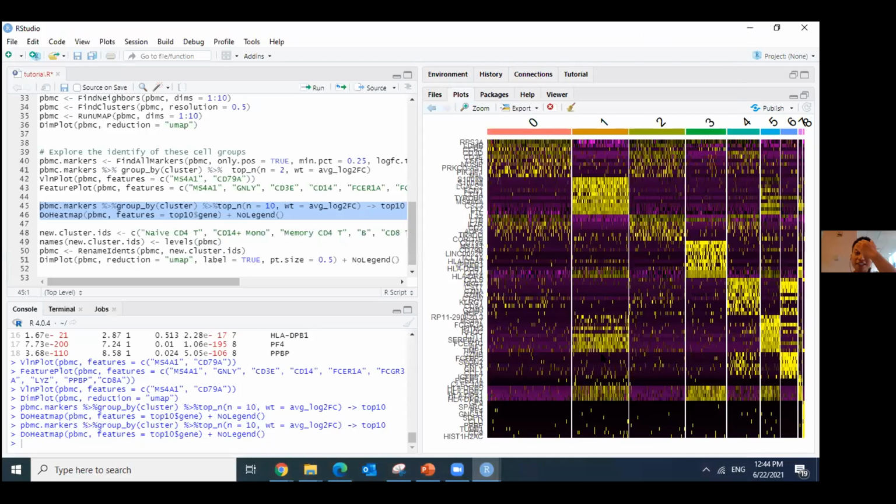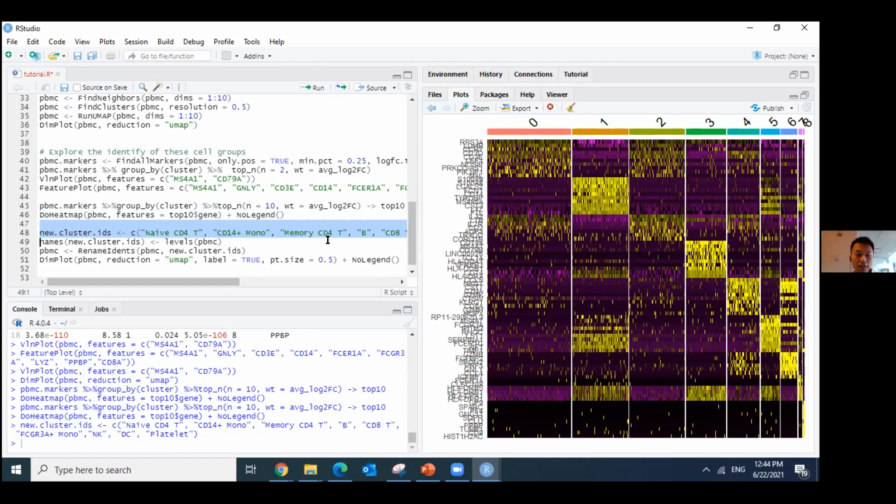Okay, so on and so forth, based on their differentially expressed genes, we'll mark, for example, group 3 as B cell because they very strongly express the B cell markers like CD79A and CD79B, and group 0 will be T cell because they strongly express CD3D and the other T cell markers, and so on. So we can mark each cell group with a different identity based on their different gene expression. Actually, their different gene expression is also the indication of their different functionalities. Because group 3 expresses CD79A, it means they function as B cells. And group 0, with CD3D, means they function as T cells.